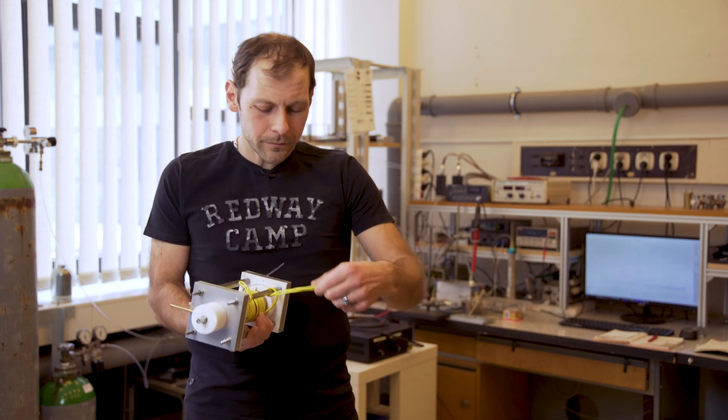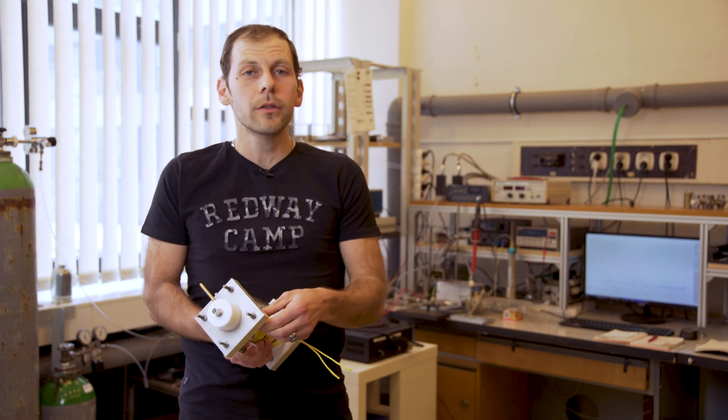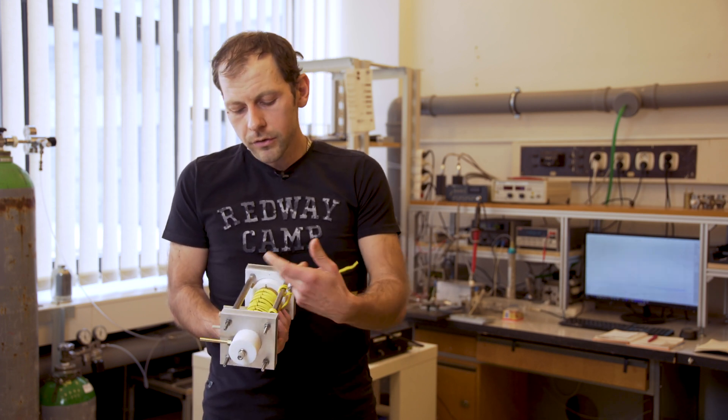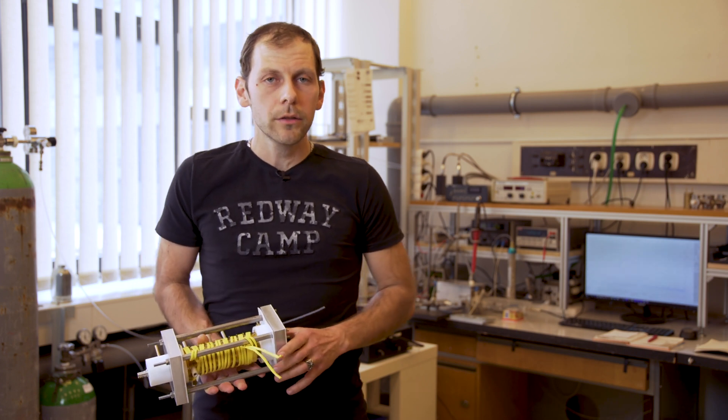The yellow wire is needed for heating because we want to have reactive ions without any water clusters. Sometimes we heat the spectrometer to more than 100 degrees.